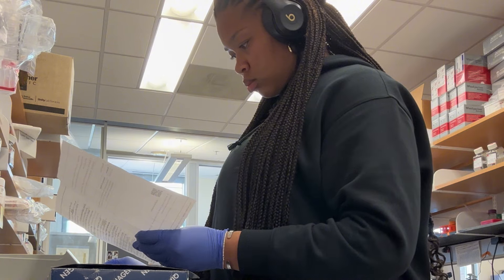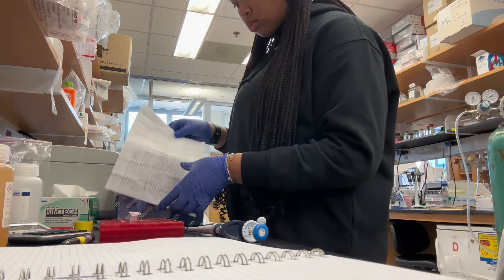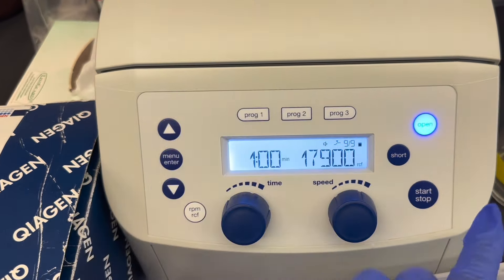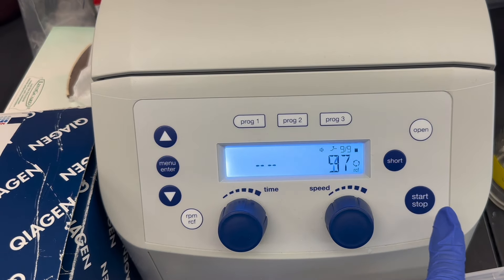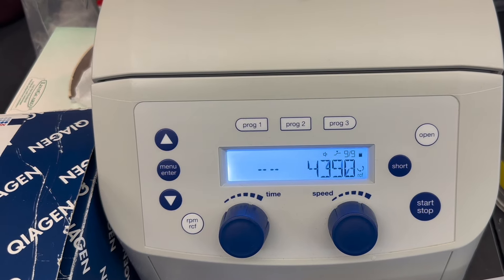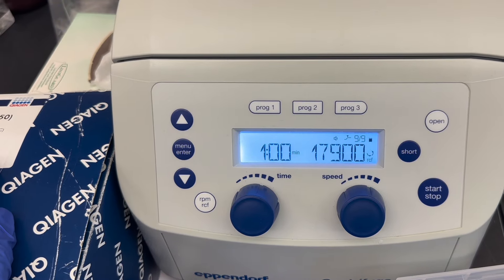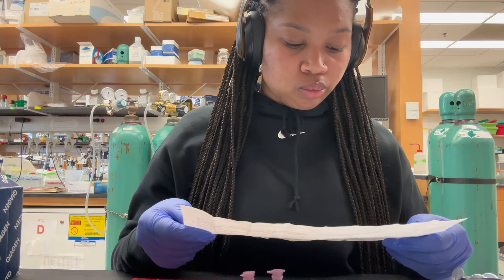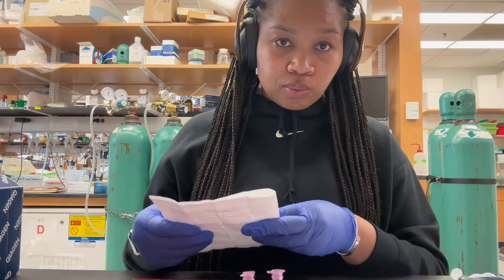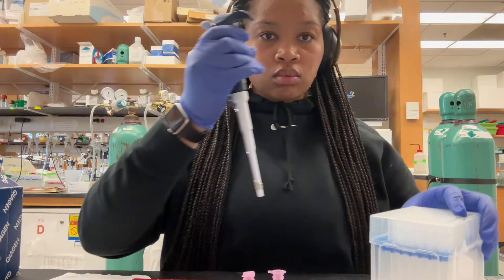This is me looking over the protocol, just making sure I'm doing things correctly and making sure it gets up to the right speed. I close the centrifuge and — I don't know if it's just me — but it's so satisfying once it gets up to the speed it's supposed to be at. It takes a second to get there; it's like 17,000 something RPM. So I continue to look over the protocol again just to make sure I'm doing everything correctly.